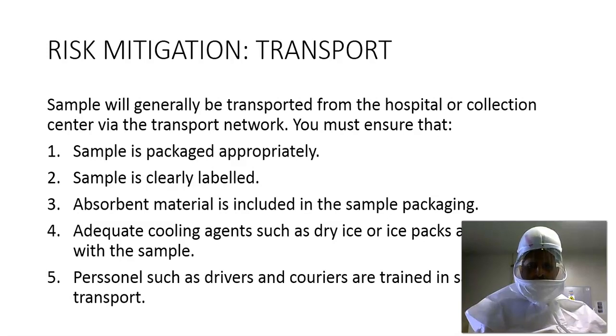Risk mitigation is generally applied to mitigate or reduce the risk posed by the biological agent. The first step in risk mitigation involves the transport chain. The sample will generally be transported from the hospital or collection center via the transport network.